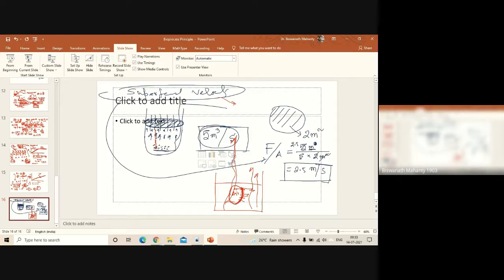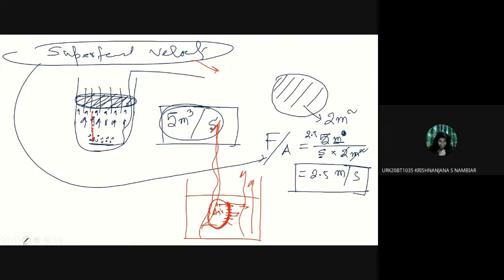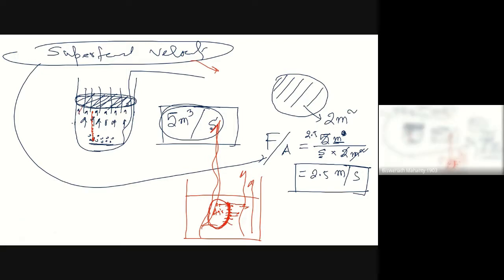And what is that empty space called? Anyone know? Vacuum. Are you getting my point? 80% I am filling with liquid, but some space is there, empty. And what is it called normally? Void. Okay, very good.